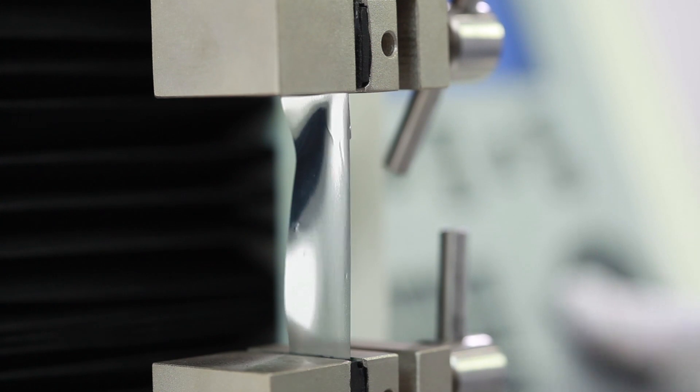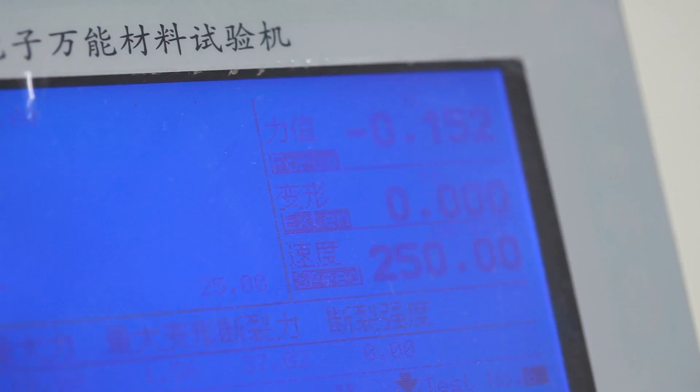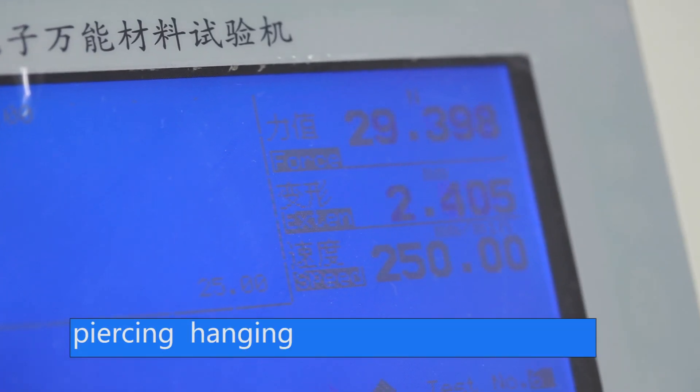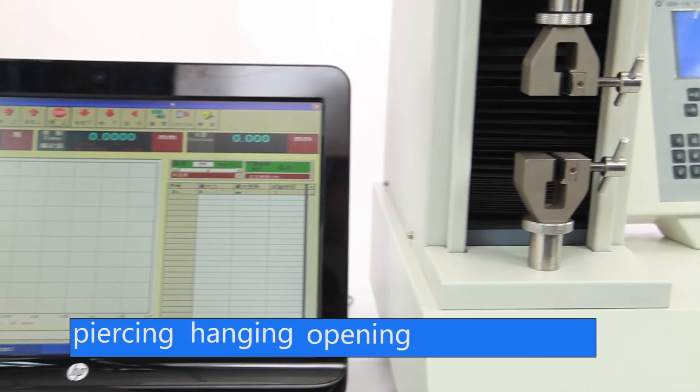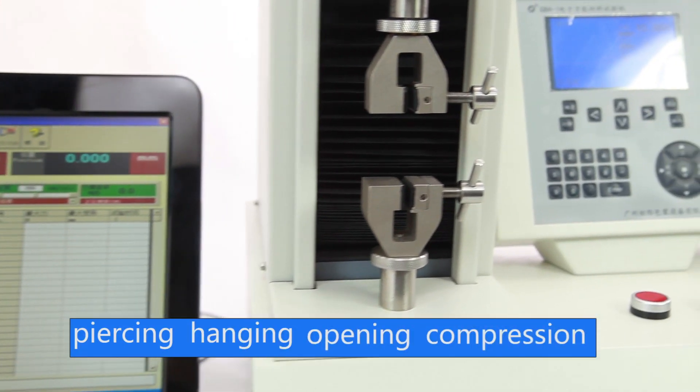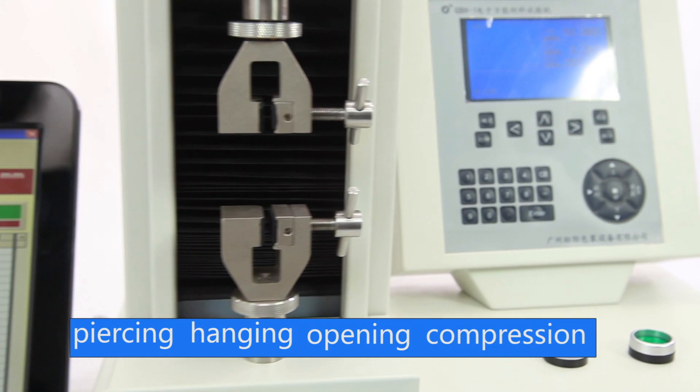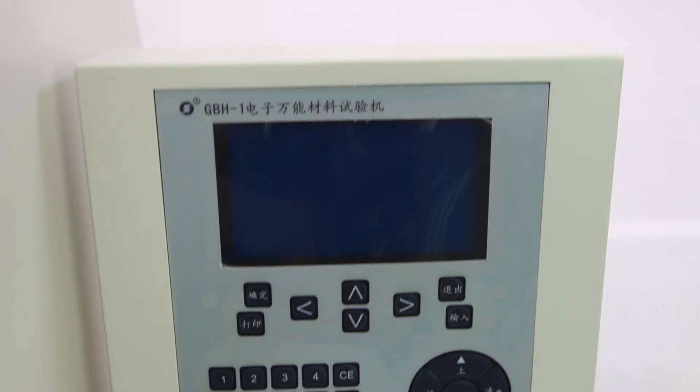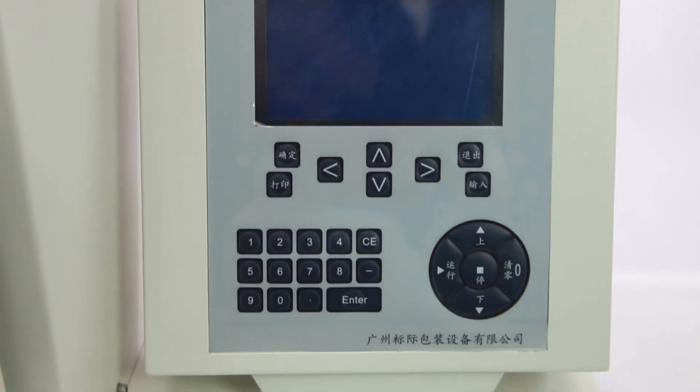It also tests strengths, piercing, hanging, opening, and compression of medical infusion bags, film, bottle caps and so on.